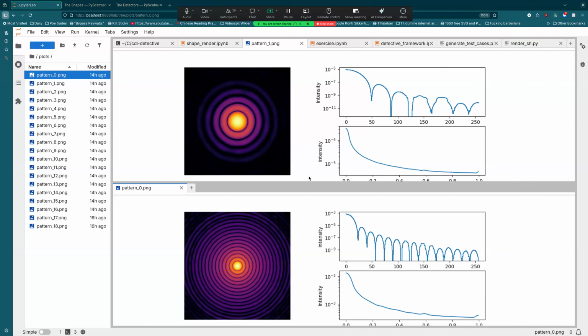One size is larger compared to the first one, but it is also spread. So it's larger and also what? Spherical in shape, spheroid, nanoparticle. Yeah, they are both spherical. I think the difference should be that this... What did you say? Sorry, it's a little bit hard to hear you.